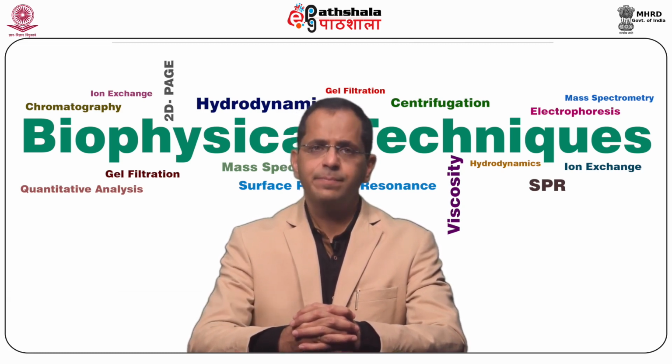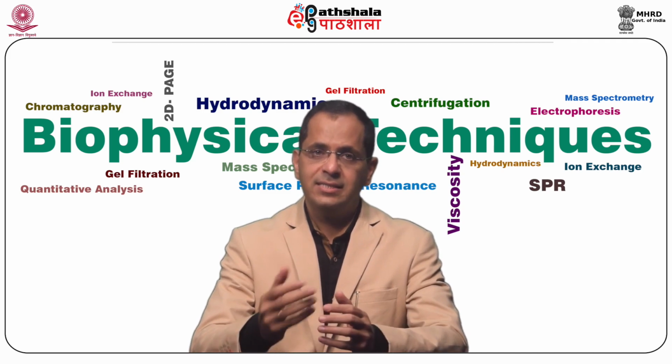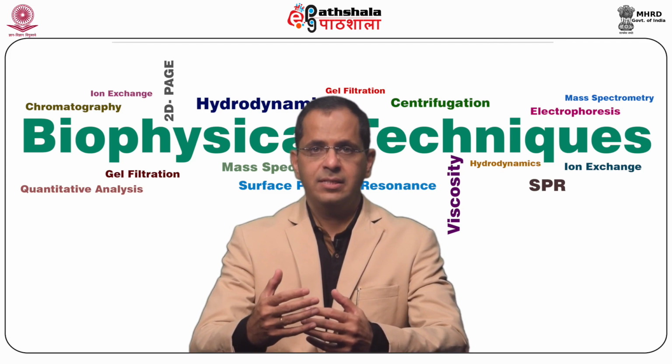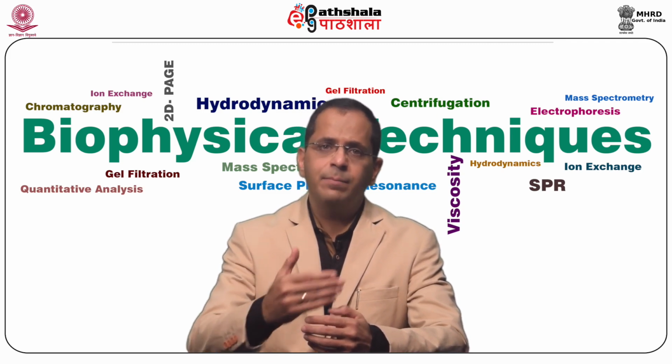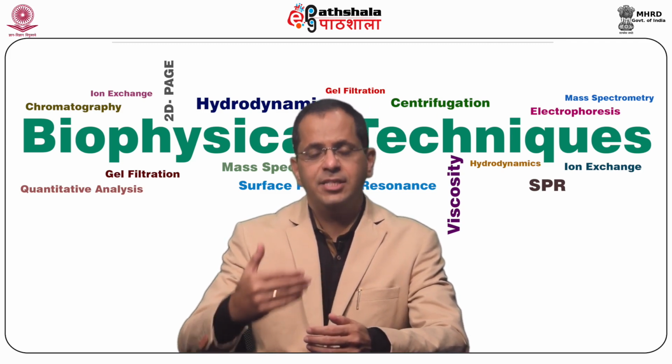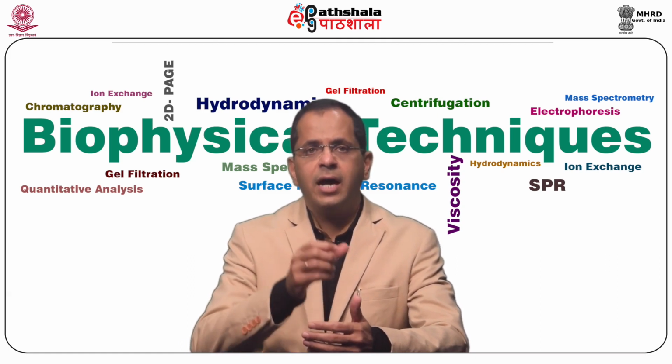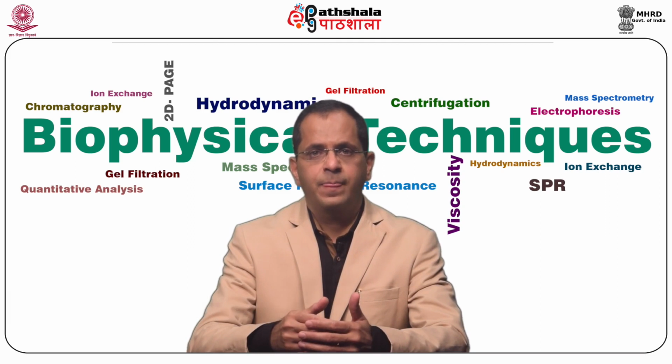It requires expensive labeling reagents. It requires a high amount of starting sample. Multiple sample preparation steps result in considerable sample loss and reduced detection sensitivity. There is what you call an ion suppression effect.